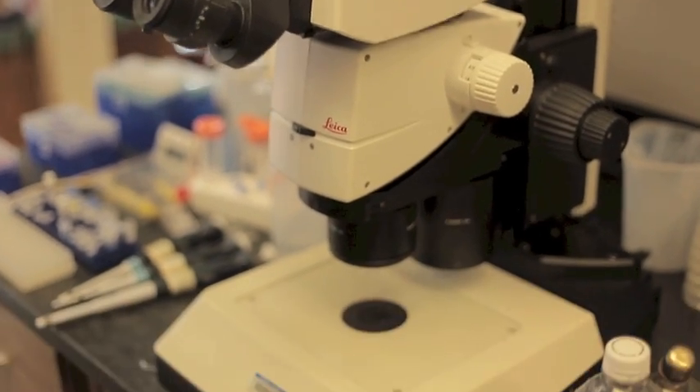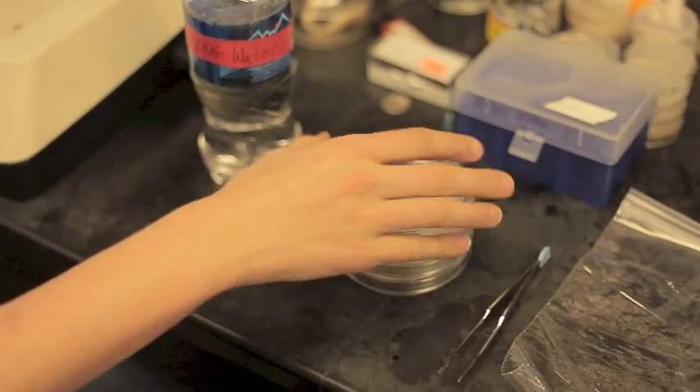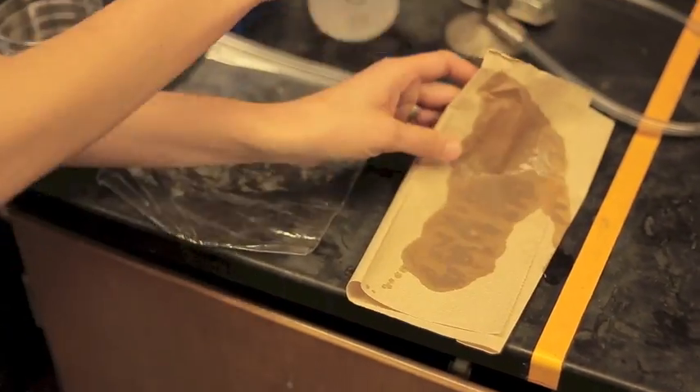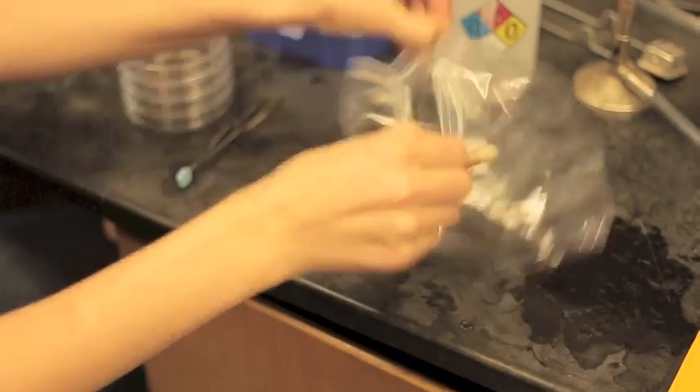To find tardigrades, you'll need a few basic pieces of equipment. You'll need a microscope, some bottled spring water, some plastic dishes, forceps — which are optional, you can just use your fingers — a plastic bag, and a paper towel, which you should wet, fold up, and then place inside your plastic bag.